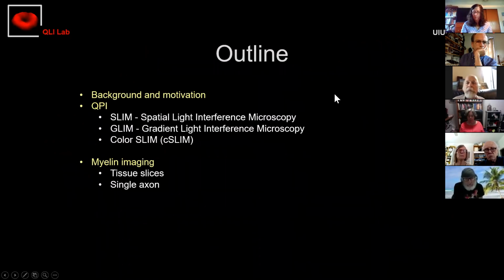The outline of my talk is as follows. I'm going to start with some background and introduction and basically define what quantitative phase imaging is and the motivation for it. Then I'm going to present SLIM and GLIM, two sister techniques, but at the same time complementary in some ways.